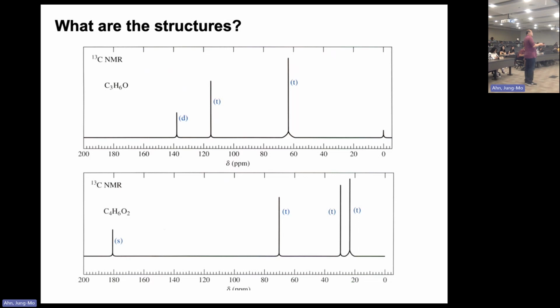We got 2 oxygens. 1 oxygen is the carbonyl. We have to place another oxygen somewhere in the molecule, right? And that's probably what de-shields it. This triplet carbon at like 70, that's the carbon probably having the oxygen. That's why it's pulled out.